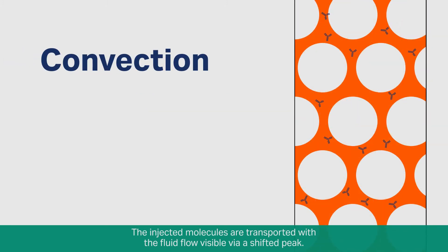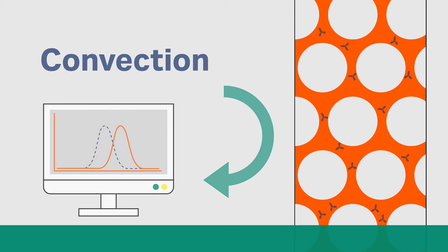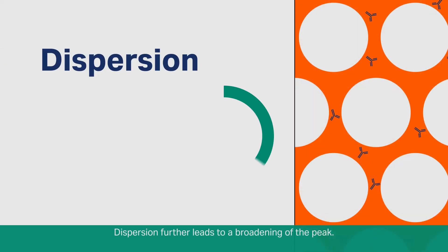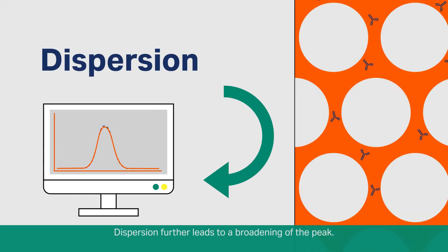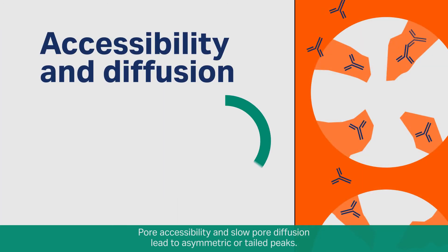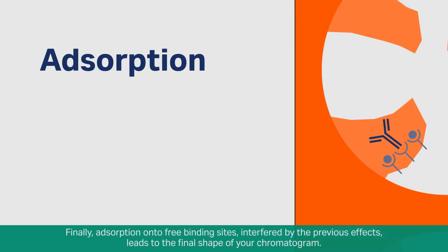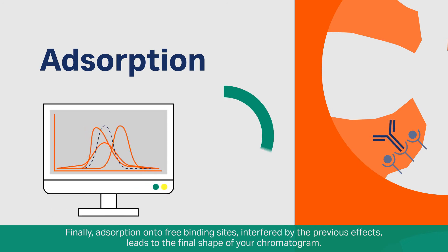The injected molecules are transported with the fluid flow, visible via a shifted peak. Dispersion further leads to a broadening of the peak. Poor accessibility and slow pore diffusion lead to asymmetric or tailed peaks. Finally, adsorption onto free binding sites, interfered by the previous effects, leads to the final shape of your chromatogram.